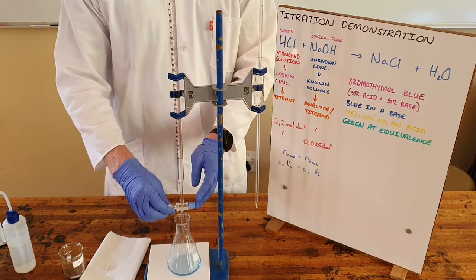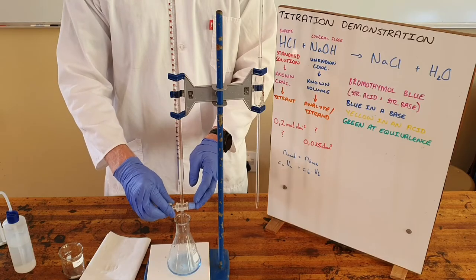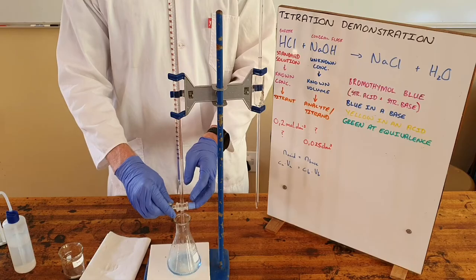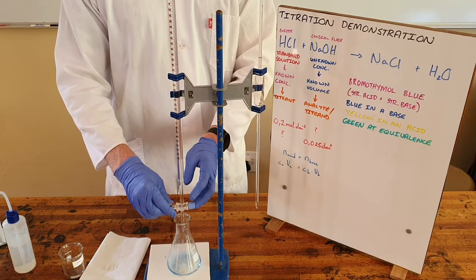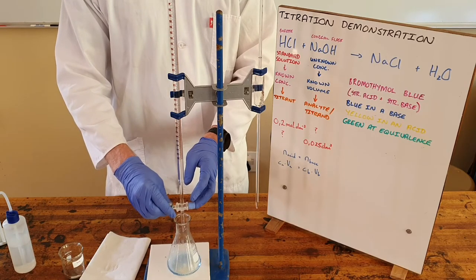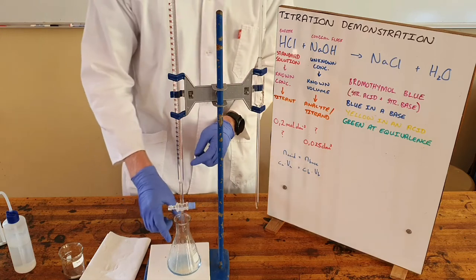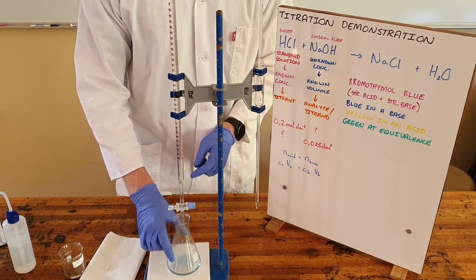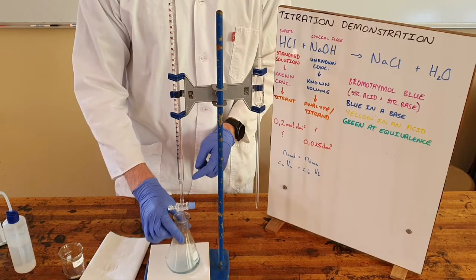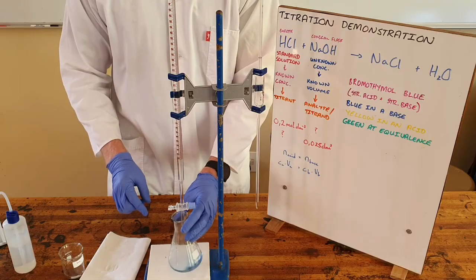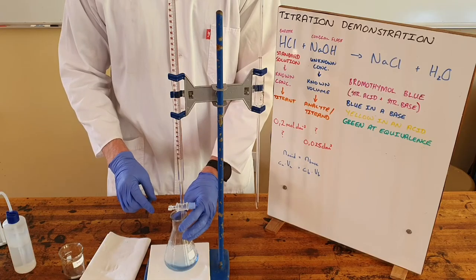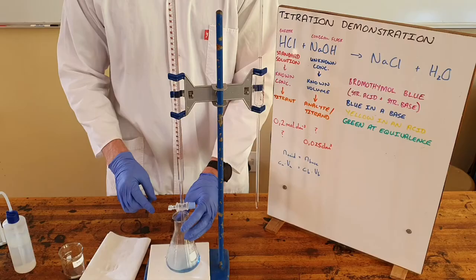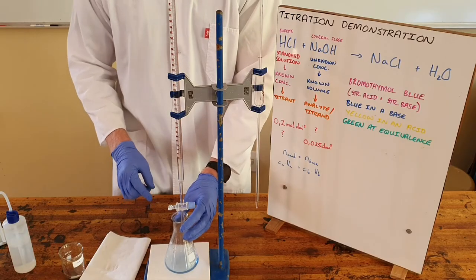So what we can do is we can speed the reaction up until we get close to around 12 at which point we would slow it down because we do not know at what exact point the equivalence would happen. Now as you can see the place where the acid is added to the solution already starts a slight color change which is why it's important as you titrate here with the acid to continue moving this so that the acid and base mix entirely.